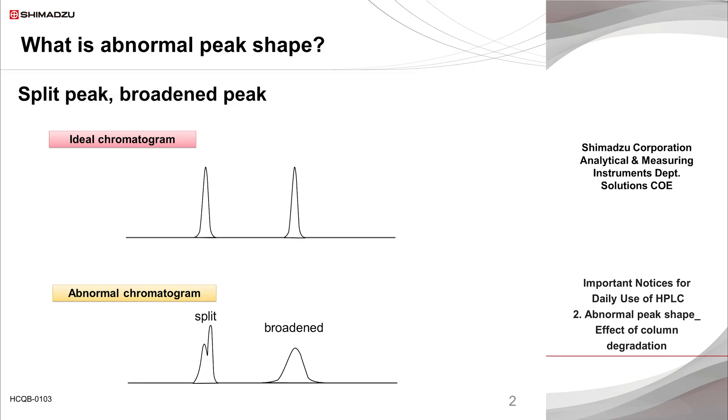As shown at the bottom of this slide, peak splitting, in which one peak splits into two or more peaks, and broadening, in which the peak becomes wider, distorted, and asymmetric, are commonly known as abnormal peak shape.